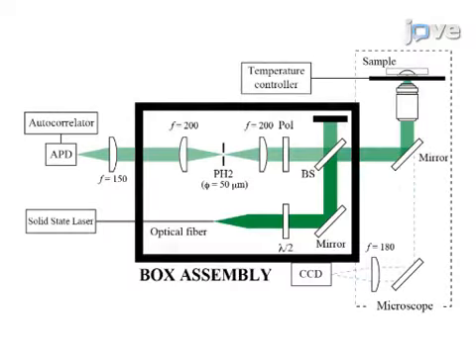This schematic provides a more complete view of the layout for the setup. After shaping the beam profile, the beam is introduced into the microscope. Light scattering is obtained with a backscattering geometry and guided to a detector. A launch mirror allows some reflected light to be observed via a CCD camera.